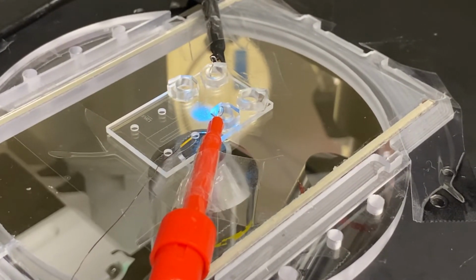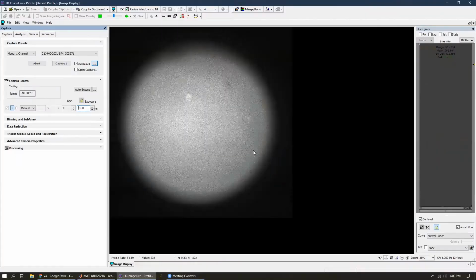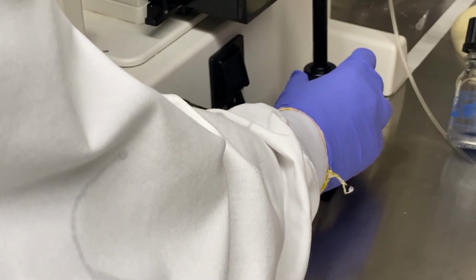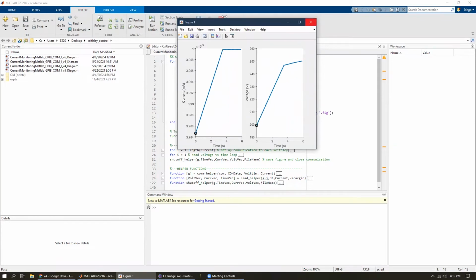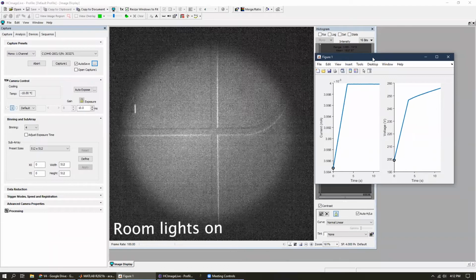Finally, turn the Z knob so that the objective slowly approaches the chip. Alternate between watching the HC image output and physically looking at the stage to avoid crashing the objective into the chip. You should eventually observe a channel come into focus. If you cannot focus onto any channel, try moving the stage in X or Y slightly and repeat the last two steps.